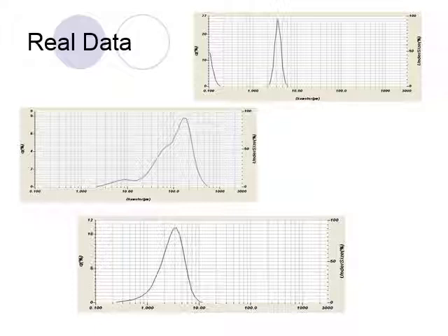That second graph shows you there's really at least 3 modes in that data. You have 10 micron sized particles. You have something that's sort of over 180, around that range, and then you have something between 100 and 10 there with that shoulder. So that I would have to deconvolute to give accurate data. And then you have a nice, left skewed, standard looking distribution. A lot more things look like the second and third view than do the first, but this is just to show you what some real data looks like.